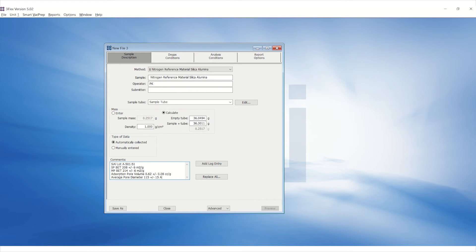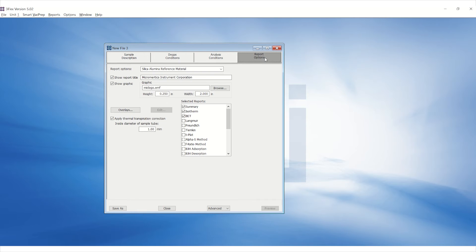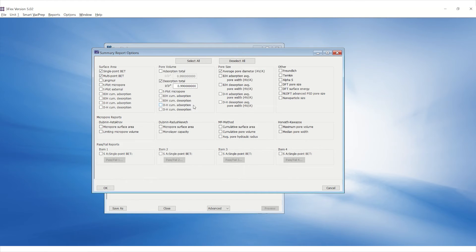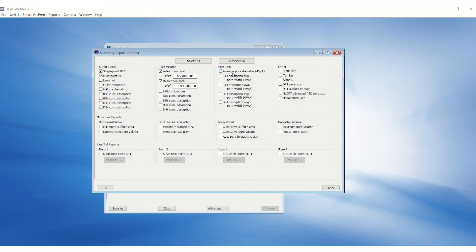Under Report Options, select Summary and click on Edit. Ensure to select Single Point BET, Multi Point BET, Adsorption and Desorption Total under Pore Volume, and Average Pore Diameter under Pore Size, as shown here.